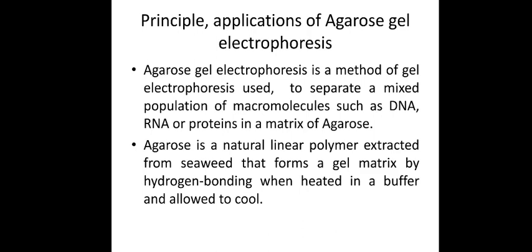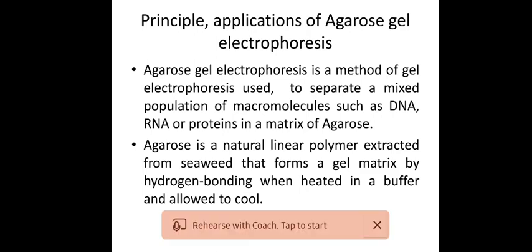Now, in gel electrophoresis, phoresis refers to the movement, and electro refers to the applied electric field. In other words, electrophoresis is the movement of molecules under applied electric current. For this to happen, the molecule of our interest must have either a negative or positive charge, and we need two electrodes which are oppositely charged so that our charged molecules can go to the opposite electrode.